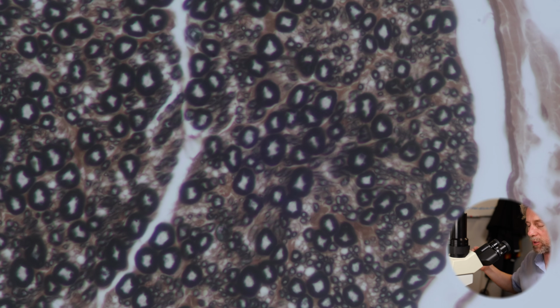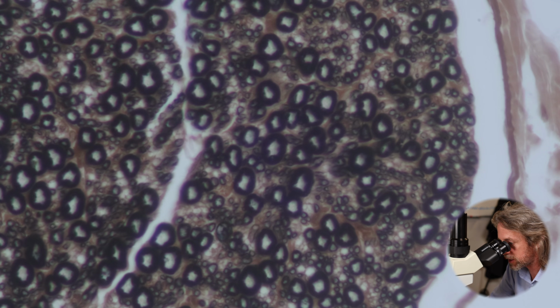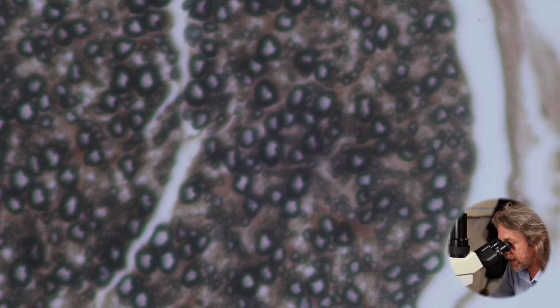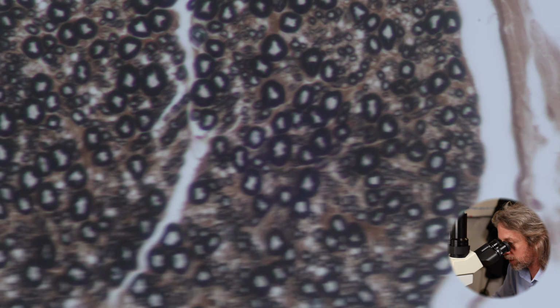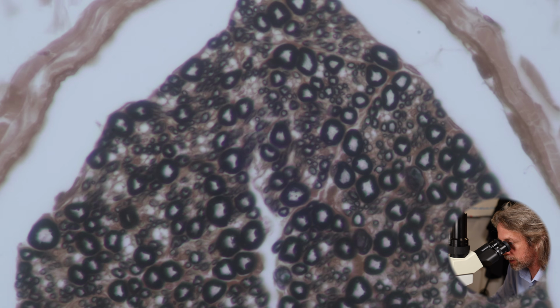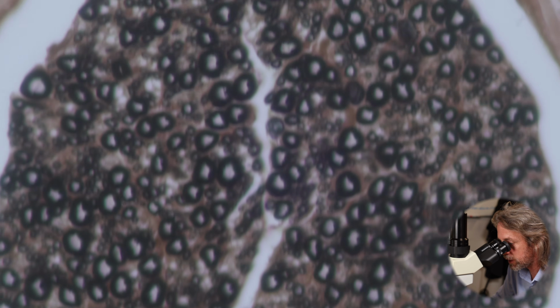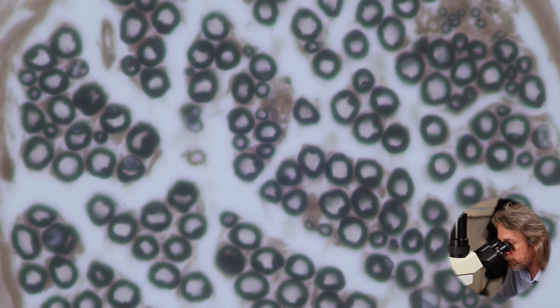And also the distance between the nodes of Ranvier will affect how fast you send action potentials down it. So clearly we've got neurons here of different sizes wrapped with different amounts of myelin, so they're doing different jobs. Isn't that interesting? That's what we're talking about when we're talking about nerves being mixed nerves. It really jumps out at you there. Very cool.